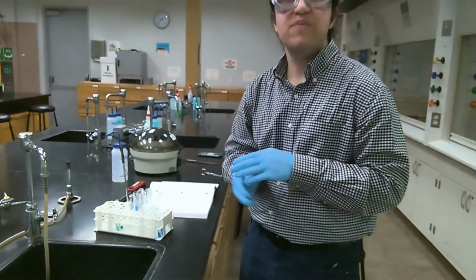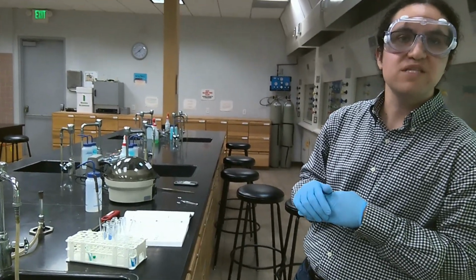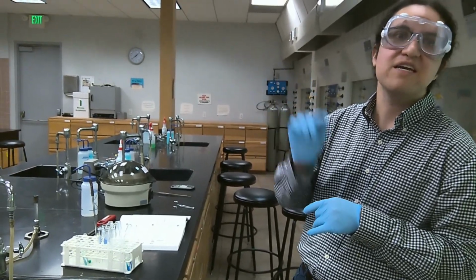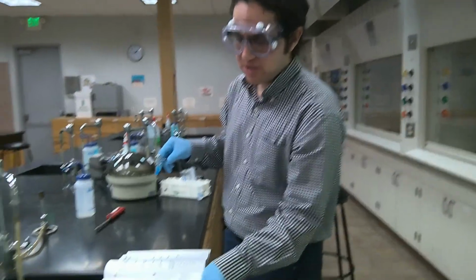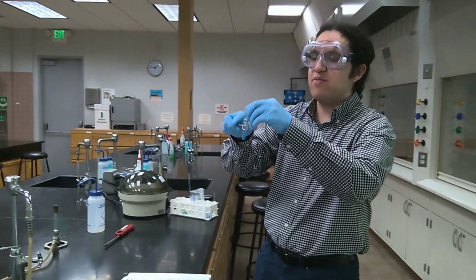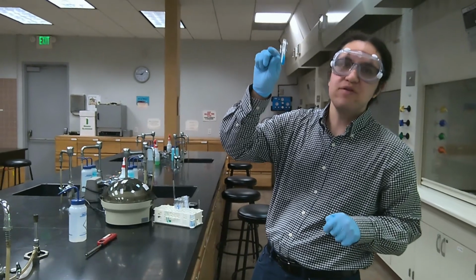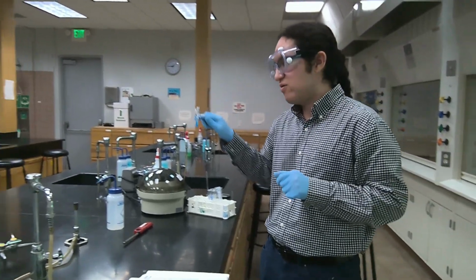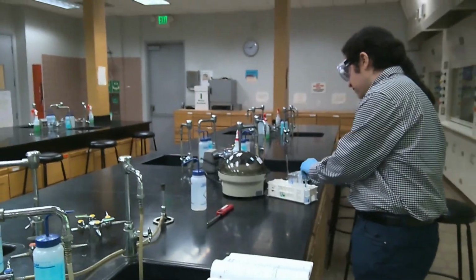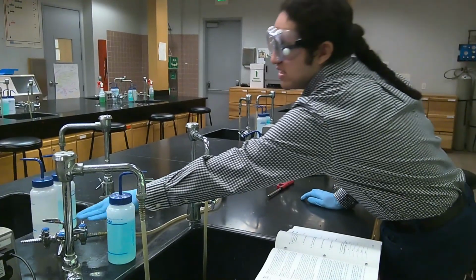Okay, we're going to repeat this process and decant out all of our liquid for the remaining 2 test tubes, and then we'll come together for the next step where we're generating copper oxide via heating. The generation of copper oxide via decomposition of copper hydroxide. So to do this, we're going to heat our copper hydroxide sample and drive off the water. Now we're going to want to use a gentle flame. So first and foremost, let's adjust and prepare a Bunsen burner flame.